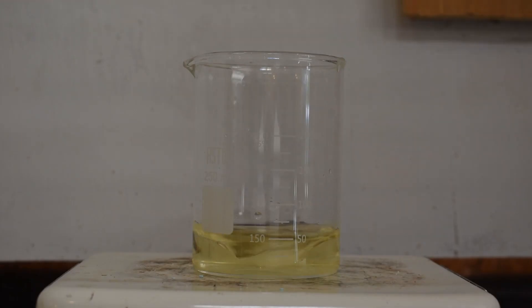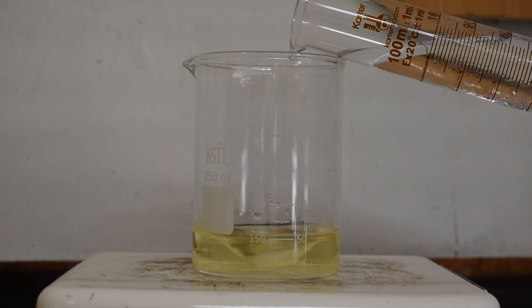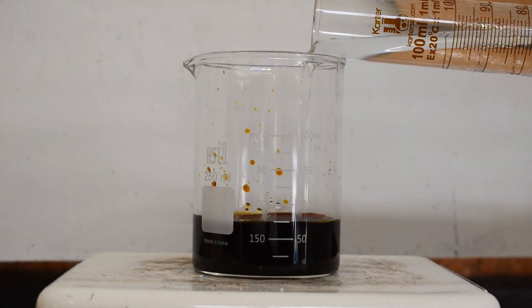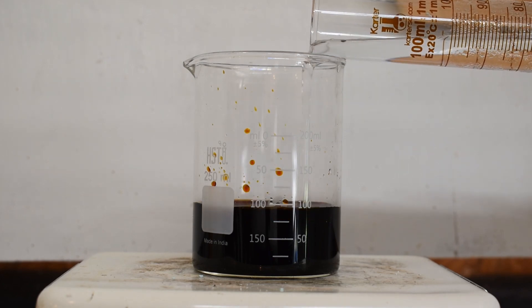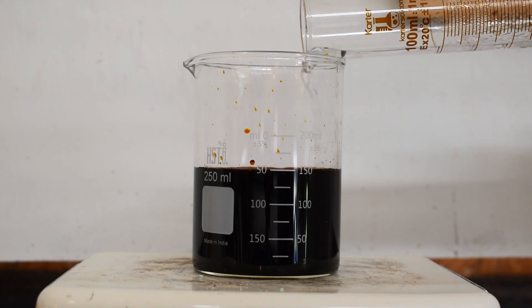Next I added 100 milliliters of 3% hydrogen peroxide. This is a pretty big excess because I want to make sure that all of the iodide is out of solution. Elemental iodine is soluble in solutions of iodide, so this will make it a lot easier to separate out the elemental iodine.